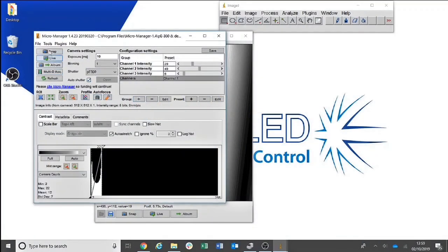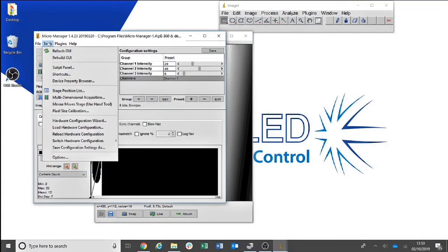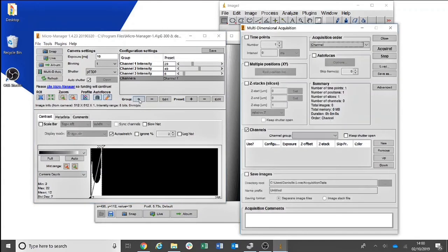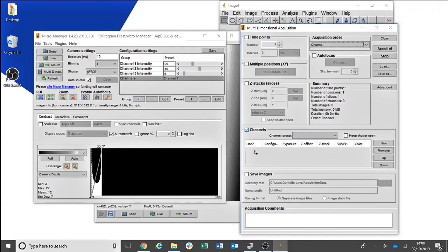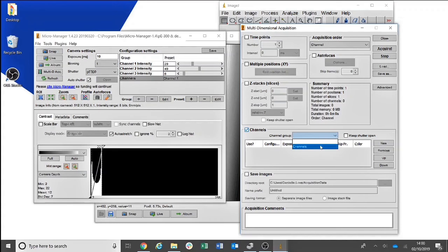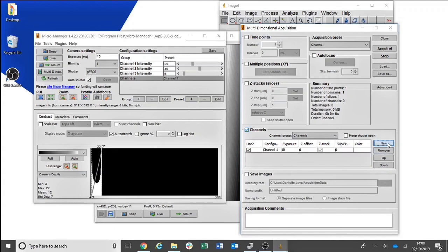To run an acquisition, you will need to head to Tools and Multidimensional Acquisition. Then click Channels and select the channel group of Channels. Then click New to add your first channel. This would be a single wavelength experiment.